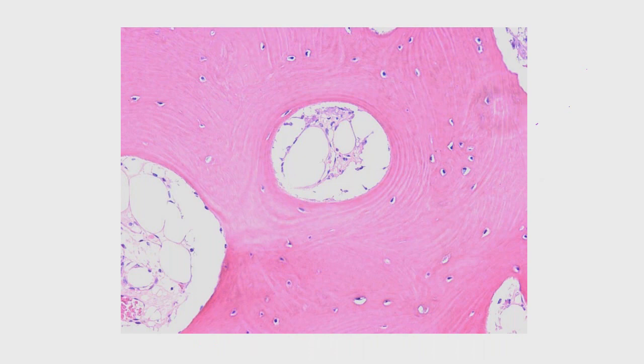Now, I actually did this years ago when I was researching a microwave decalcification project. And normally, accelerated heat is something that you would not want to use on bone marrow because it heats it up so fast, it's hard to control. But with the right decalcifier, you can actually do something like this. But whether this was done with a microwave method or through a normal method, these are the results that you want to see. You can see the concentric rings going around here.